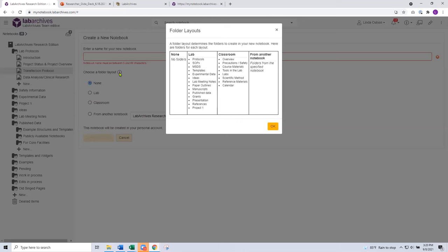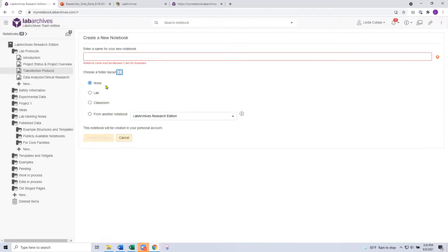If you're just starting out and not quite sure what the best layout is for your lab team, you could use our lab layout, which gives you a sample structure — pre-populated folders created for you. Then within those folders you will create your own pages or sub-folders. In the future you could also base your new folder structure off of a previous notebook. You choose your option or choose no layout and start from scratch, give it a name, then click create notebook. It's that simple — you've started your own Lab Archives notebook where you can start adding data.